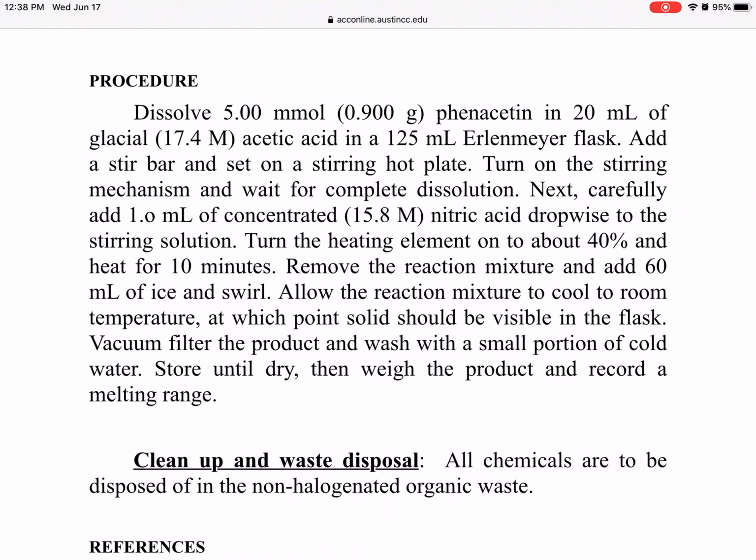Now all the impurities are in the solution, but your crystals look much nicer than the crude product, more defined. Sometimes you will see shiny crystals, some look like needle shapes, some like plate shapes, some like a beautiful coral. You're so happy: oh, beautiful crystals, my compound is pure. Afterwards we still have our recrystallized product with a liquid, which is your water and ethanol.